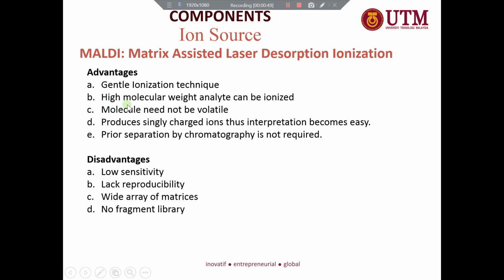Then the molecule need not be volatile. It produces singly charged ions, so interpretation becomes easy.